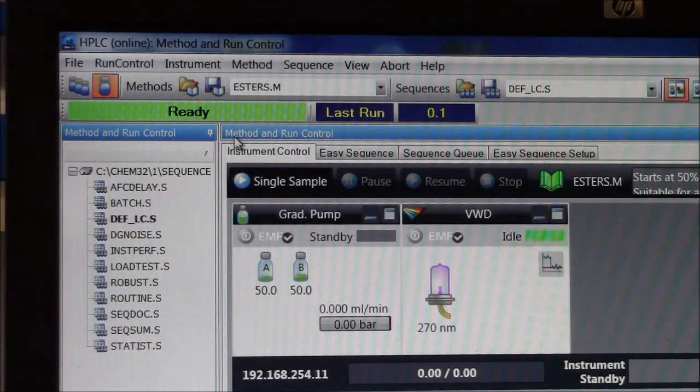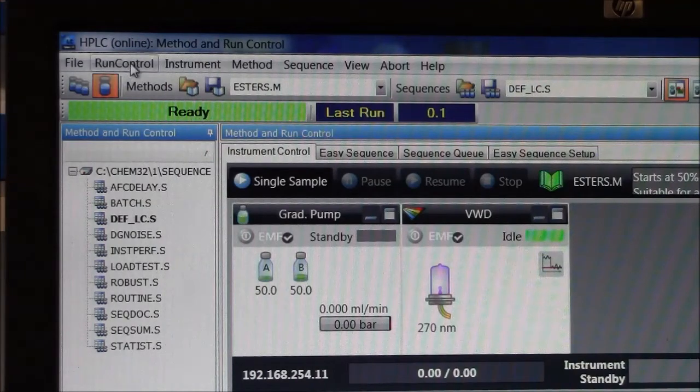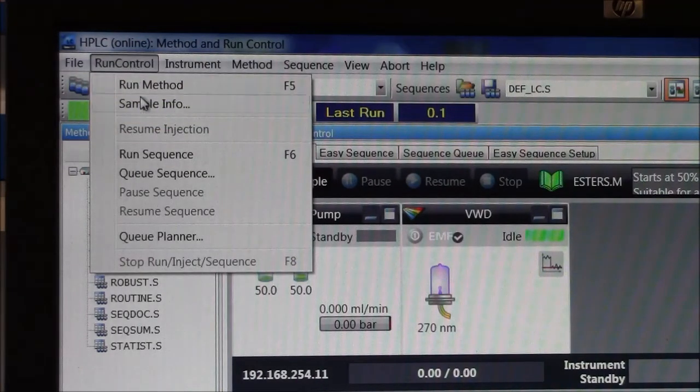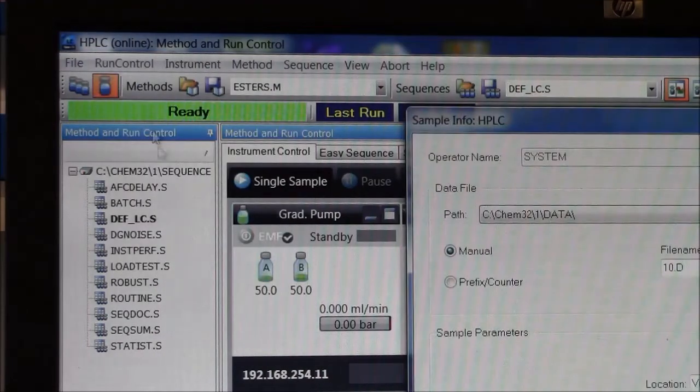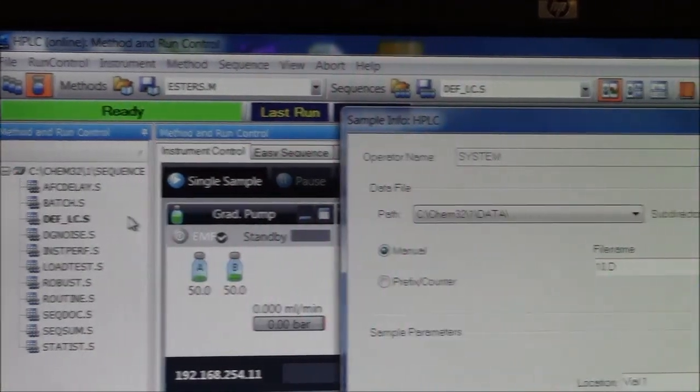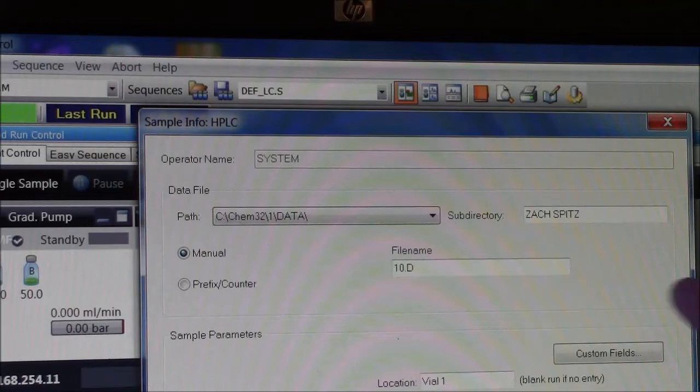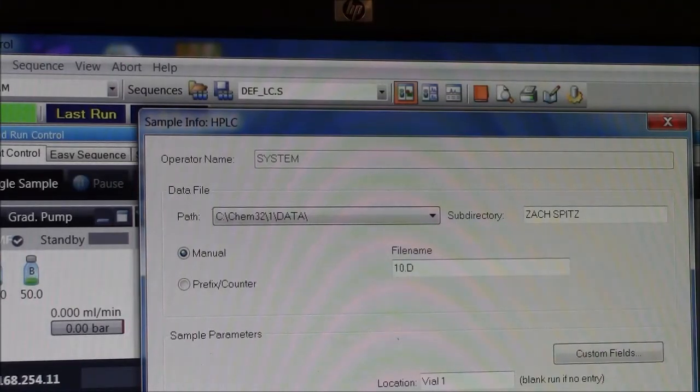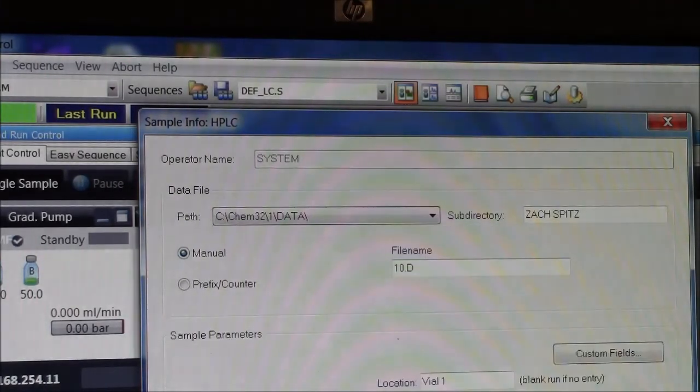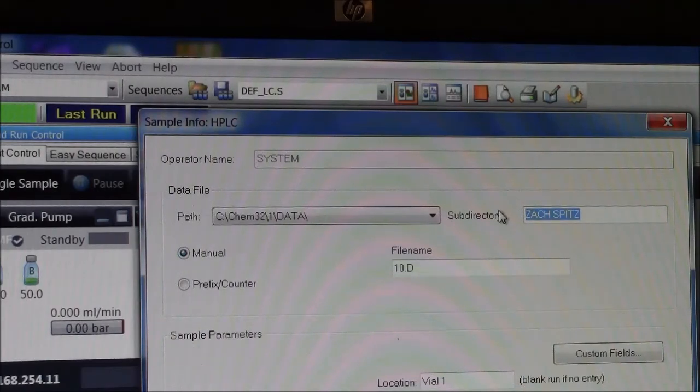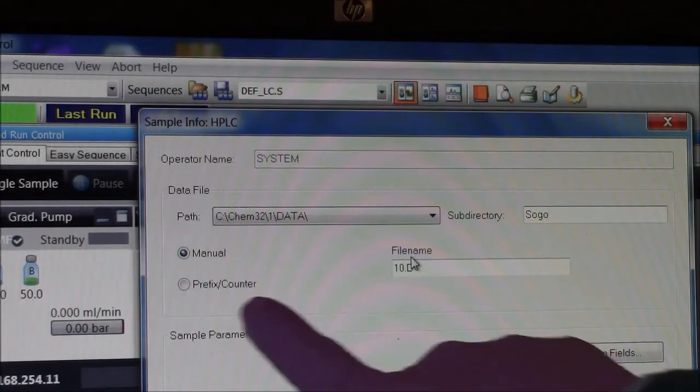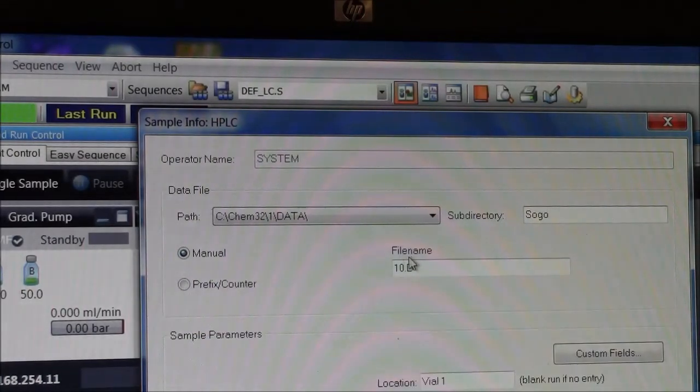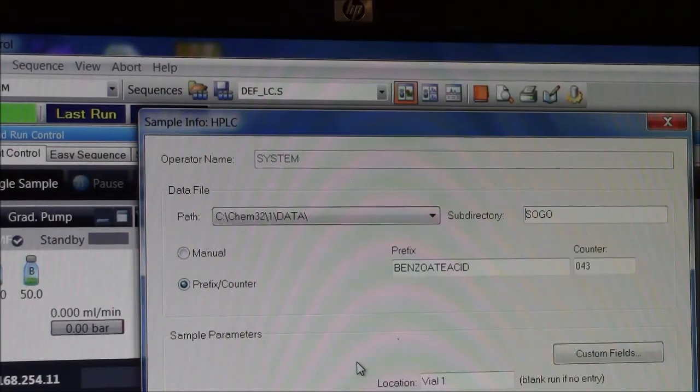Before I run my sample, I'll go here to run control, sample info. Subdirectories important. There's one main data directory, but you want your data to appear where you can find it, so here I'll just say sogo is my subdirectory. It's important that I check this prefix counter. That will make it so my old data is never overwritten.